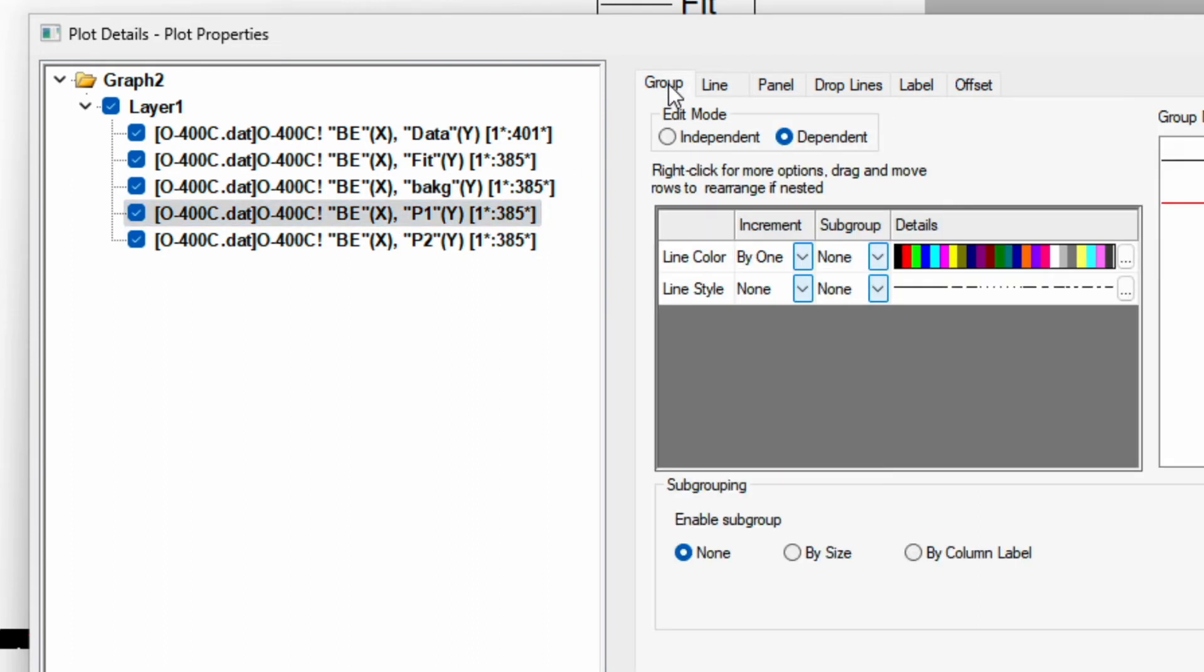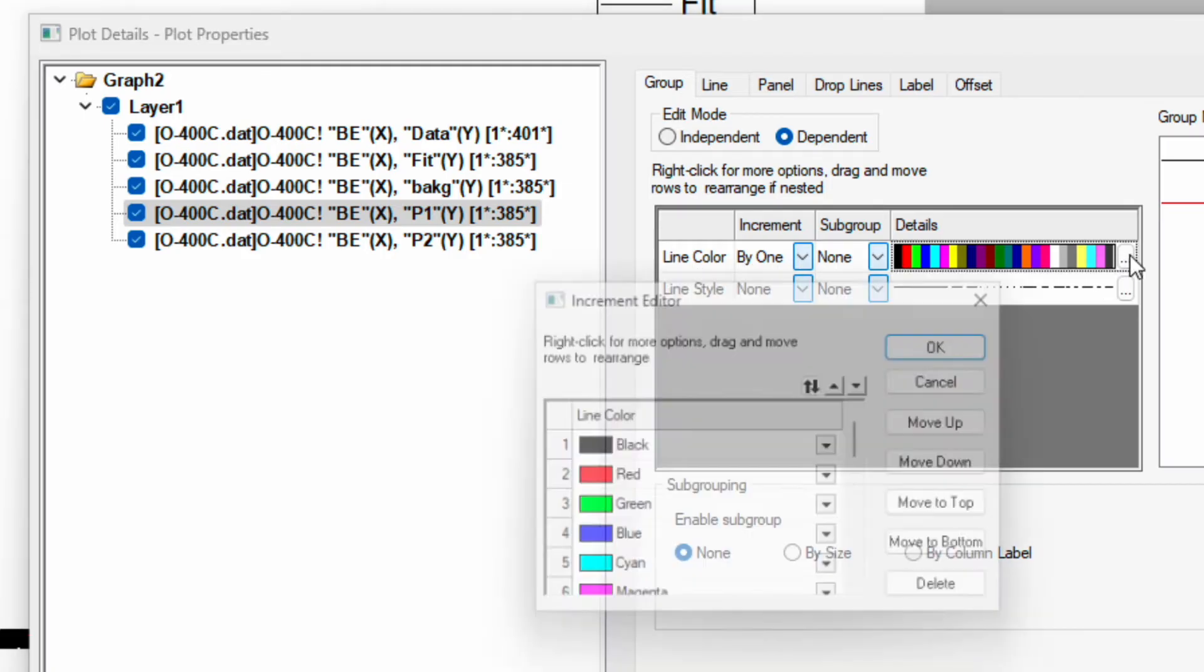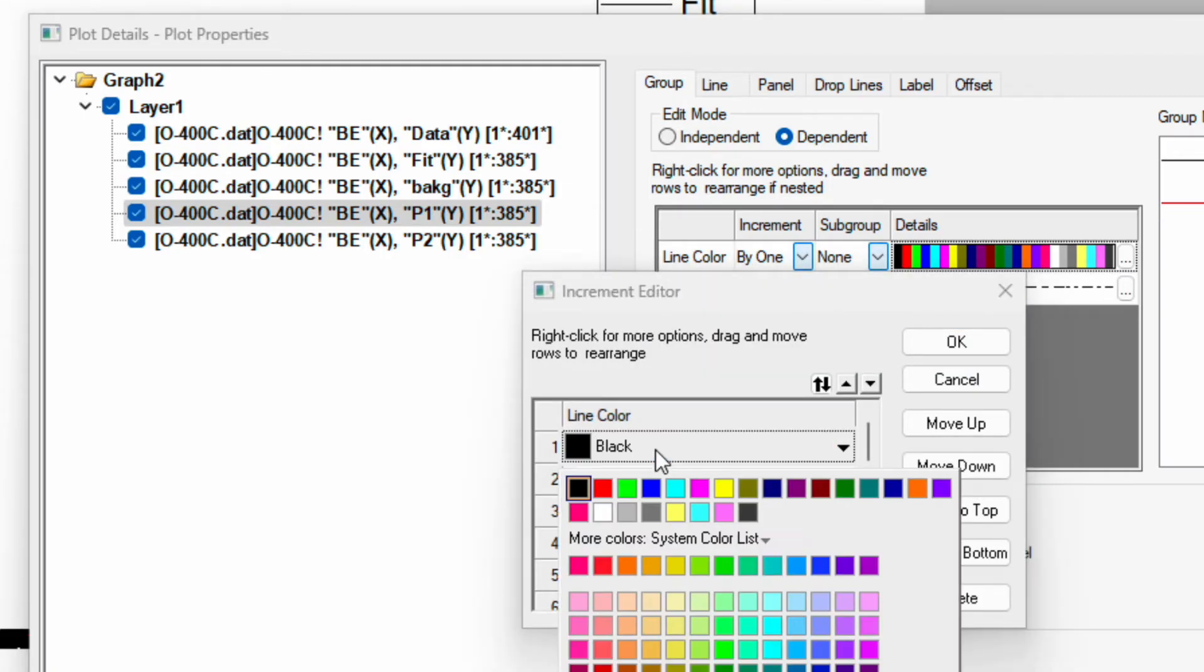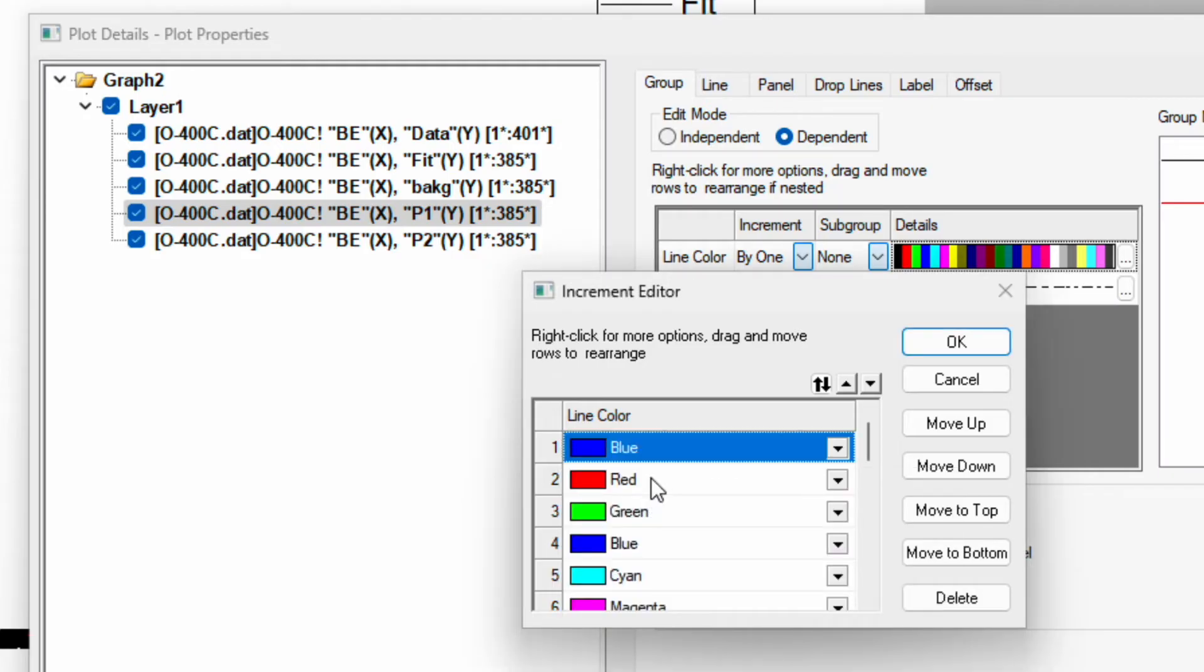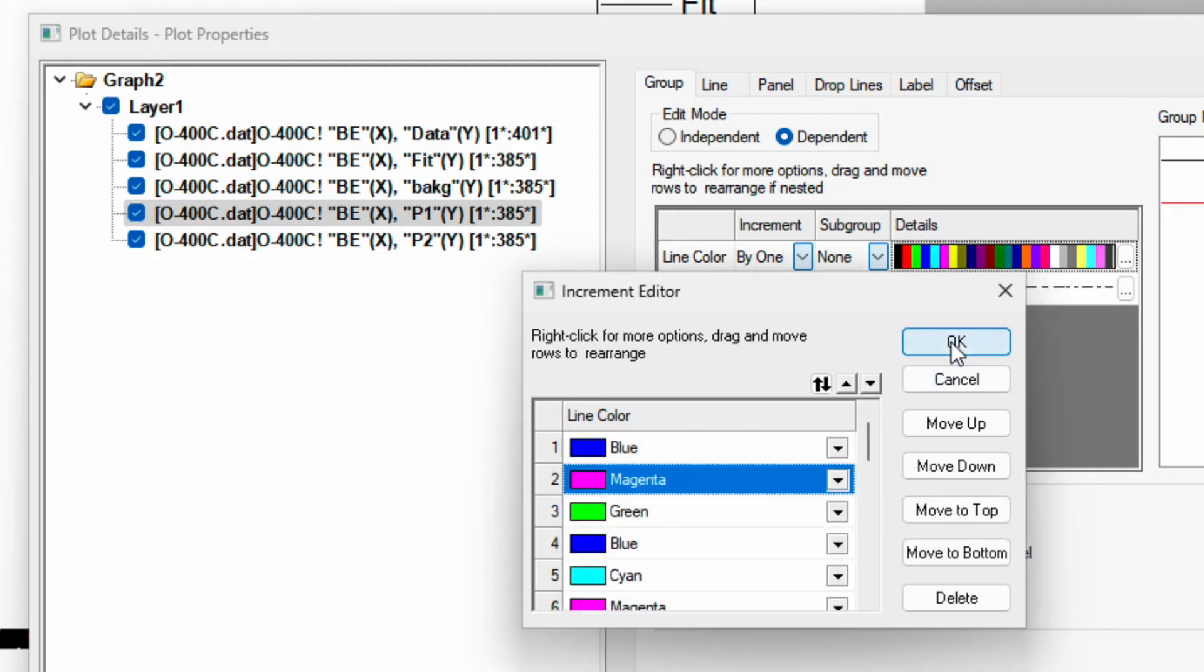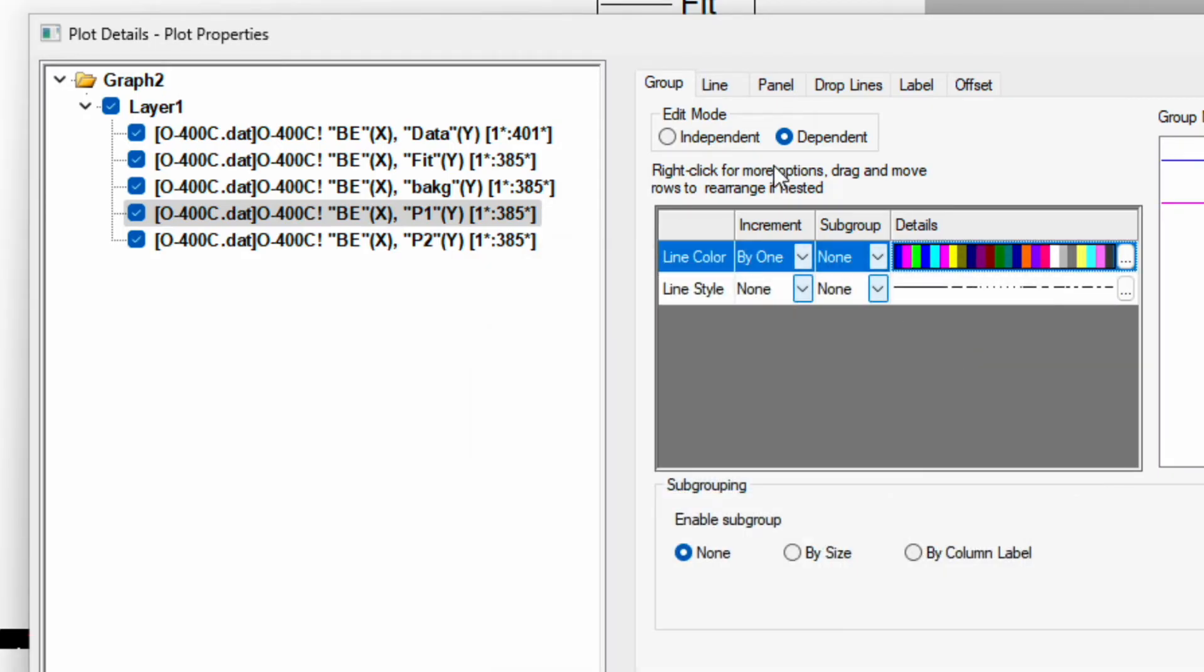Then go to pick P1 and P2. First go to the group. Here you can change color, here you can see the line color. Click on these 3 dots and change this black to blue and the second pick to pink. Click OK.